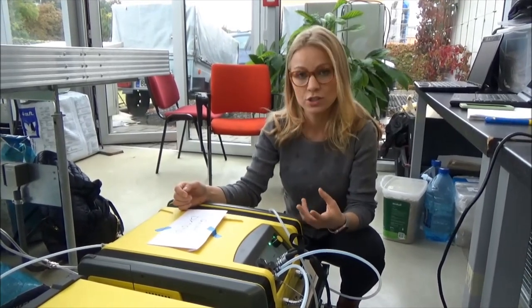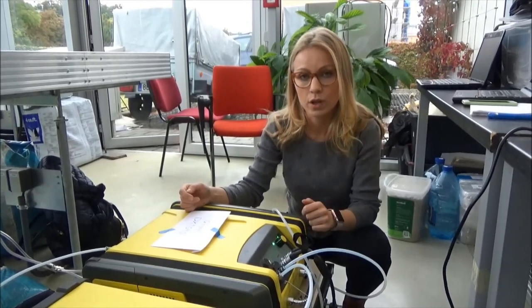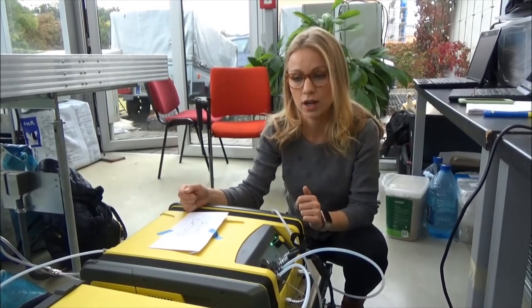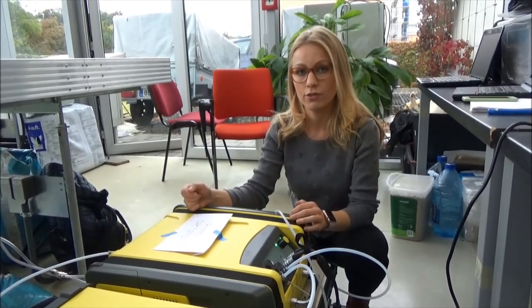In addition to these two analyzers, we have two different gas chromatographies and then one analyzer which is based on cavity ringdown spectroscopy and photoacoustic spectroscopy. So we are doing comparison measurements with these five systems.